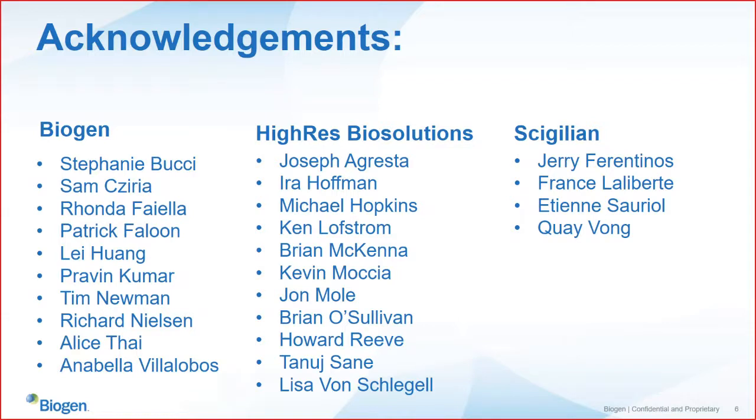Okay. And then we'll say the final question will be, sorry, Melissa, just get it up. How do you deal with evaporation issues with respect to assay ready plates?